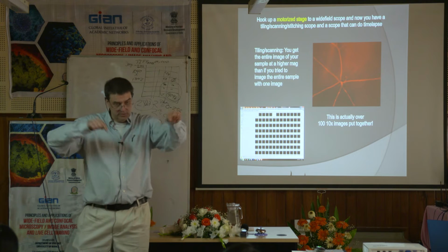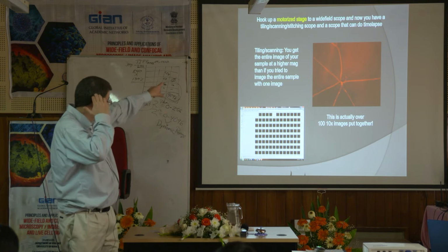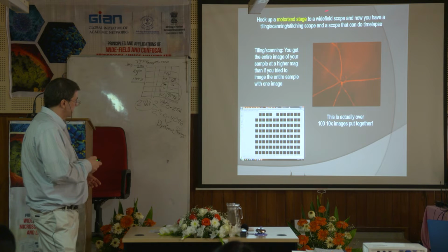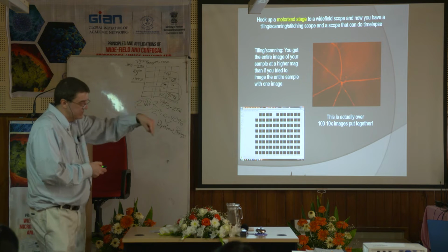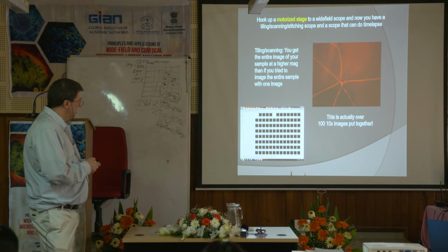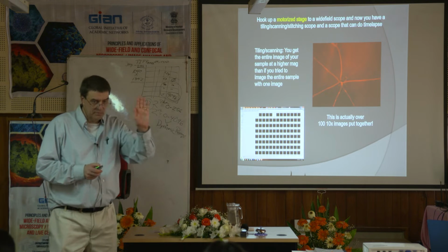And on mine, I can pick multiple cells or multiple spots, and I can come back again and again. So by hooking up a motorized stage to a microscope, you then have the ability with software to create a time-lapse system. You can visit the same point and program it to come back over time. So you can make movies like that with the motorized stage. And also you can do that tile scanning stitching we talked about yesterday. Remember, take the little pictures, put them all together.